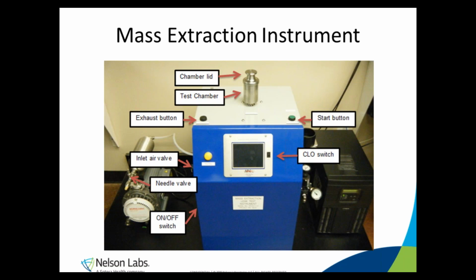This instrument will operate as a standalone unit, or you can operate it through a computer. ATC offers a 21 CFR Part 11 compliant software package. We have that here at Nelson, and we use that for all of our testing. The software package controls the user access and secures the data and tracks the changes.